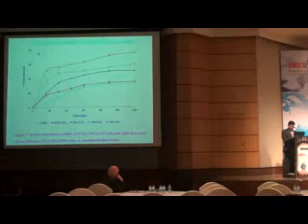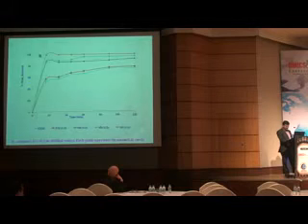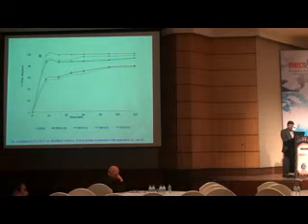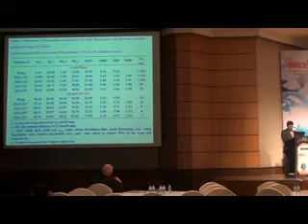It is around 5104.33 for the pure drug against 439.3 for the solid dispersion at the 16 theta position, and the same case with the 18 theta position, it is also relatively reduced. So the degree of crystallinity was reduced tremendously in the solid dispersion 1:9 when compared with the physical mix.